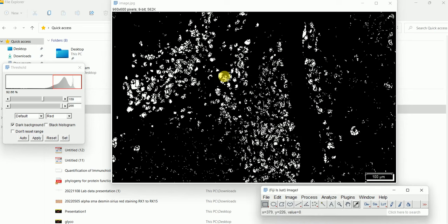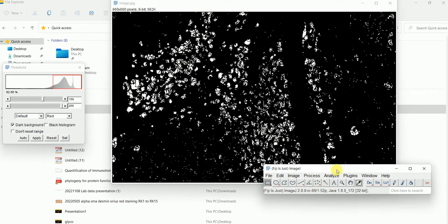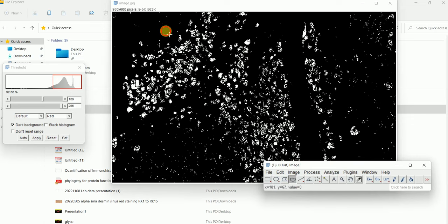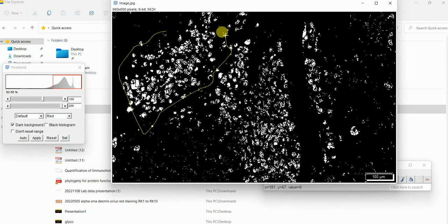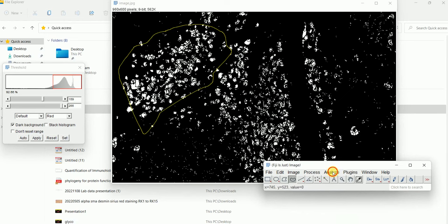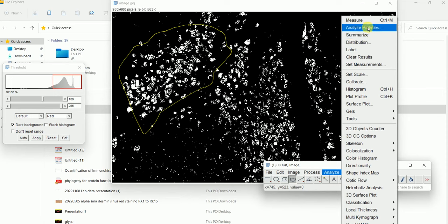But what if you want to count only the cells in a specific area? To do so, in the image software select the oval/circle selection tool. Right-click and make a circle around the area where you want to measure the particles. Then go to Analyze and go to Analyze Particles.